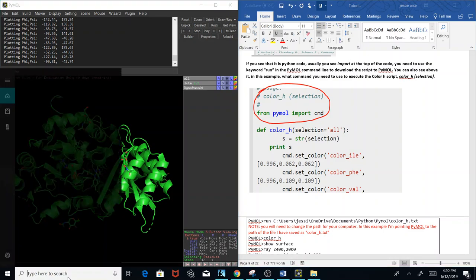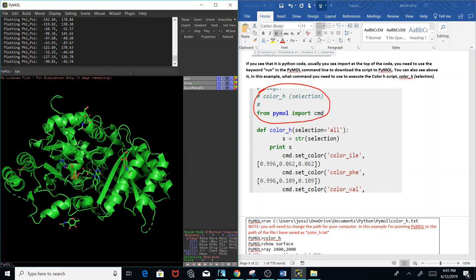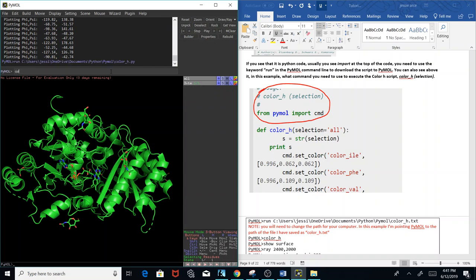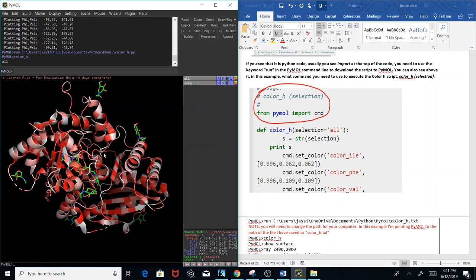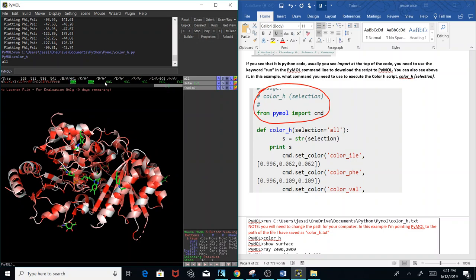I already have it saved with the .py extension. In PyMol, type 'run' because it's a .py file — it's a script, not a plugin, so we don't use the Plugin Manager. Copy the full path of the file and paste it after 'run'. On Windows, you can get the full path from File Explorer. Click run, and once I run it I can use the 'color_h' command. To remove ligands from view, click on each one, go to hide, and now they're gone.